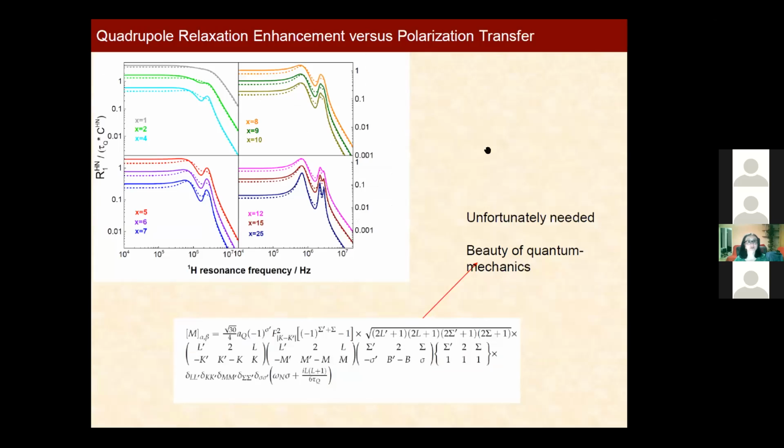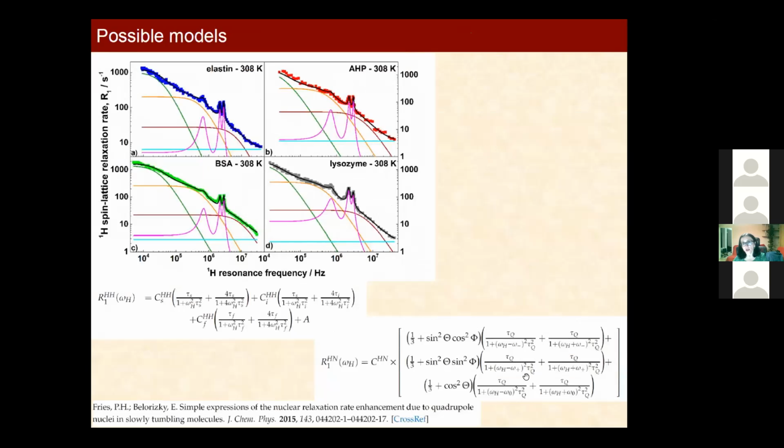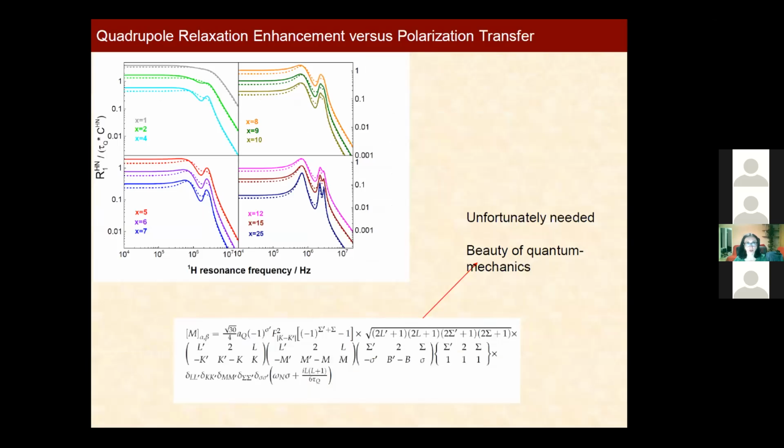Now, okay. Then something about the quadrupole parameters and the quadrupole relaxation enhancement, before I continue with proteins. I said that this equation is so great and of so much use. Here we compared the predictions of the relaxation equation delivered in that paper, which has a very simple mathematical form, with something which we call the general approach to the quadrupole relaxation enhancement.